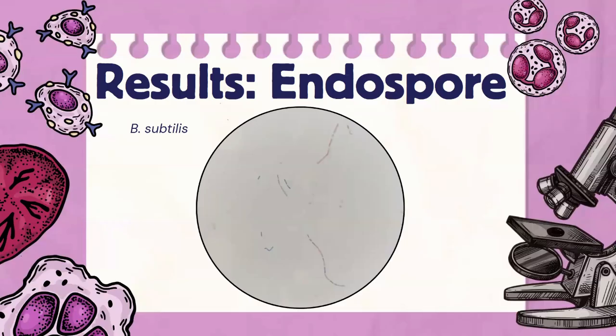For our endospore staining for the B. subtilis, it came out really well. You can see the red bacteria with the blue endospores inside of them, and it came out really great. We used two methods. For ours, we used one where we steam fixed and one where we heat fixed it normally. And this is the heat fixed one without the steam fixing, and it came out really well.